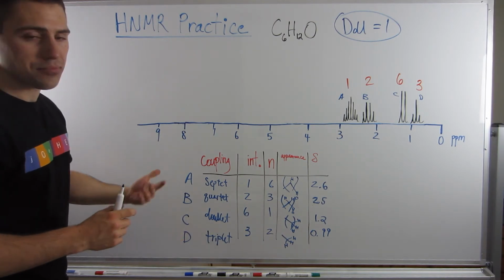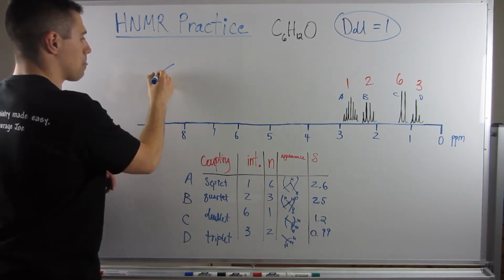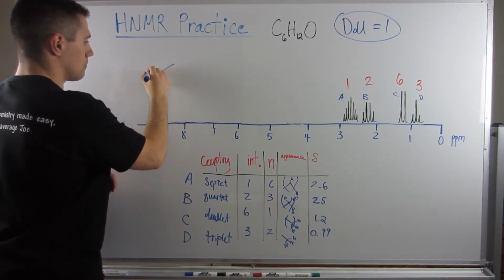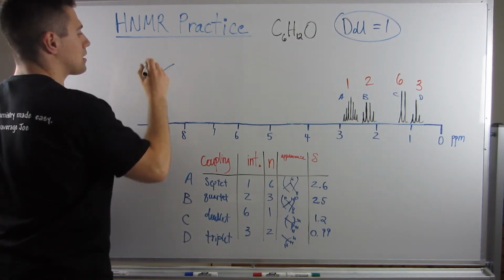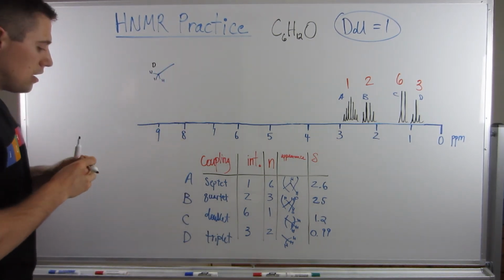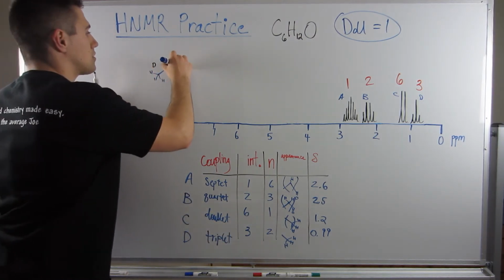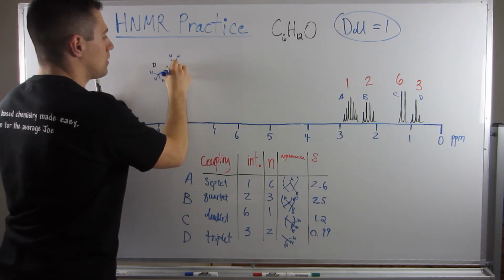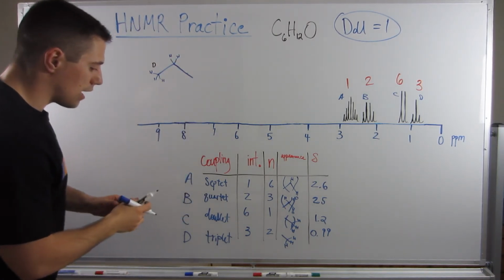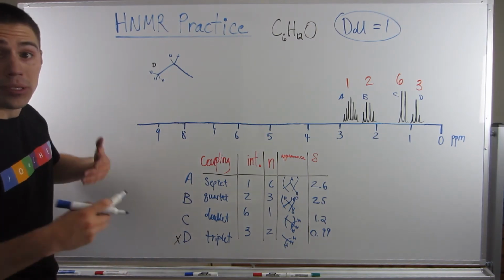Alrighty, so now let's start deducing a structure. I'm going to start off with D. It's super simple, right? Time and time again, we've seen that be a good starting place. Okay? So I'm even going to label it D. You can do this labeling as you draw or not. Sometimes it's helpful. Alright, so D needs to have 2 neighbors. So if I put these neighbors right here and continue my chain, not really worrying about where it's going, I then try to find, if I X this out, where's the integration of 2? Well, this could very well be B, right?